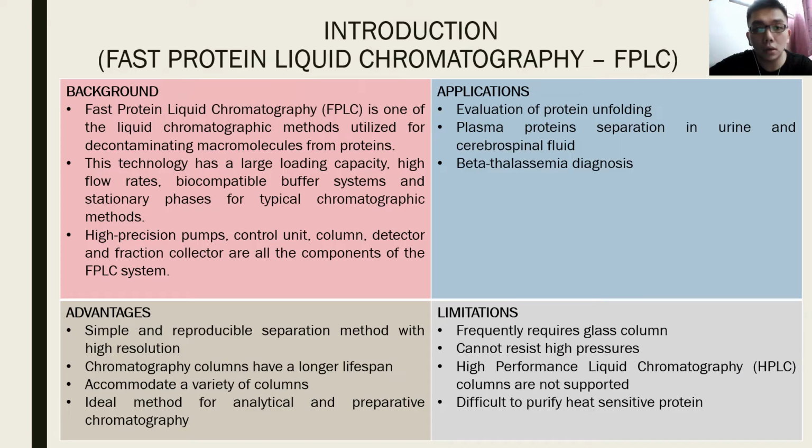Regarding the introduction of fast protein liquid chromatography (FPLC), it is one of the liquid chromatographic methods utilized for decontaminating macromolecules from proteins.